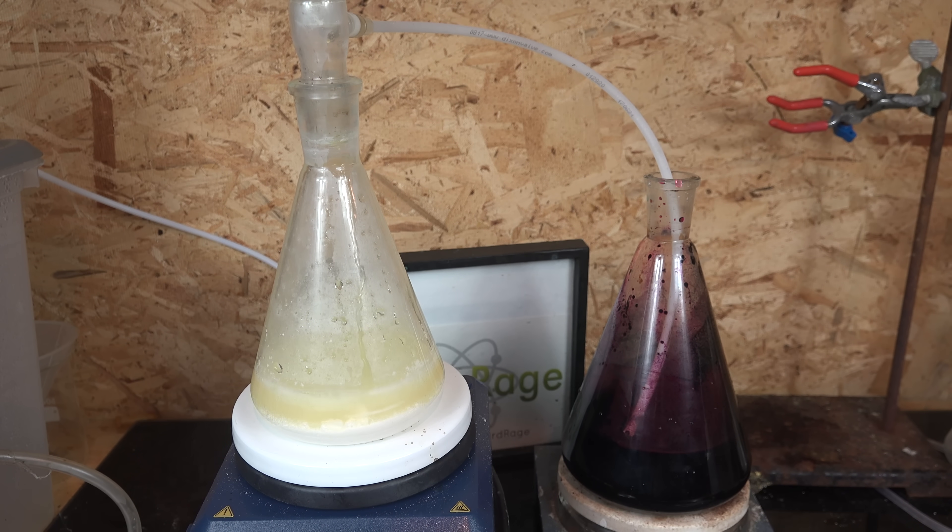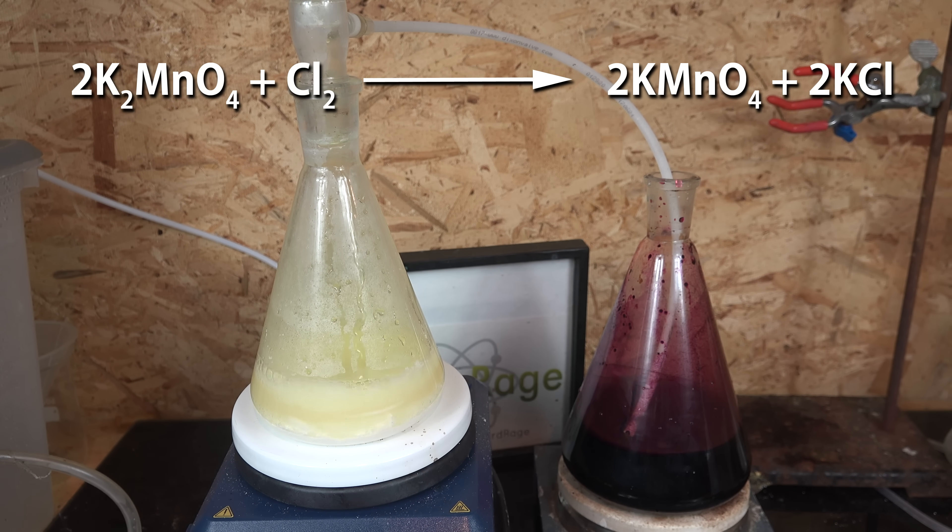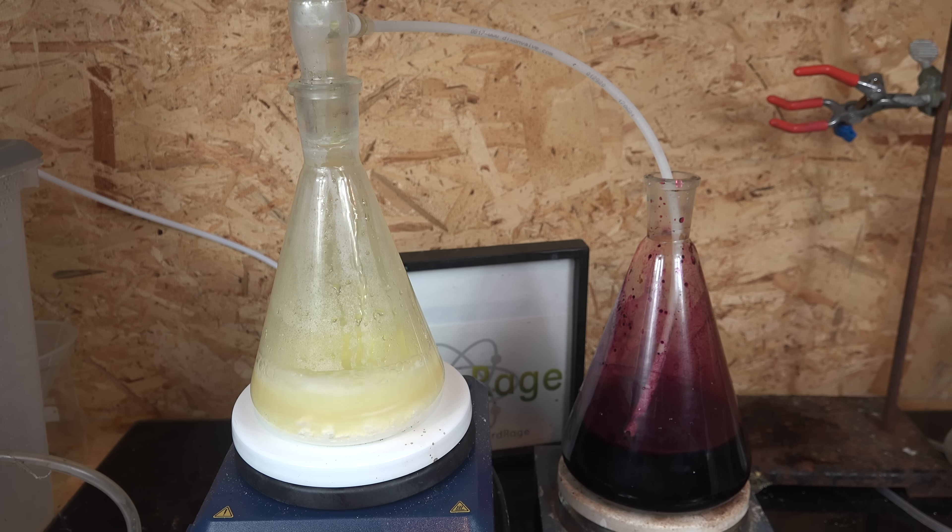The chlorine gas is very soluble in the strongly alkaline mixture and reacts very quickly. What's happening is the chlorine is oxidizing the potassium manganate to potassium permanganate, with a byproduct of potassium chloride. Industrially, electrolysis is used to directly oxidize and precipitate the potassium permanganate. I might try electrolytic processes in the future, but for now I want to brute-force it with chlorine gas.